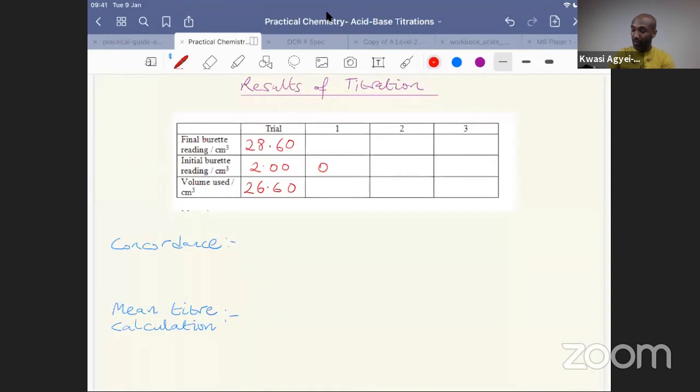In our first proper run, we fill the burette all the way up to the 0 mark, so 0.00, and then we carry out our titration, and we find that we have used 25.40. Okay, so the titre volume is 25.40, and then we go on to do our second accurate run. The second accurate run, again, for convenience we're starting with a starting volume of 0.00, and when we've carried out our titration, we find that the end volume, the final volume, is 25.30. So we have a titre volume of 25.30.